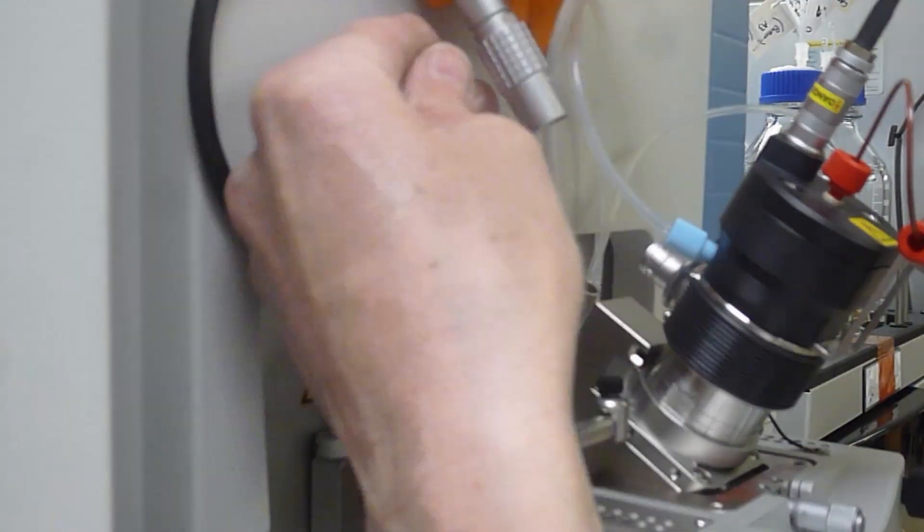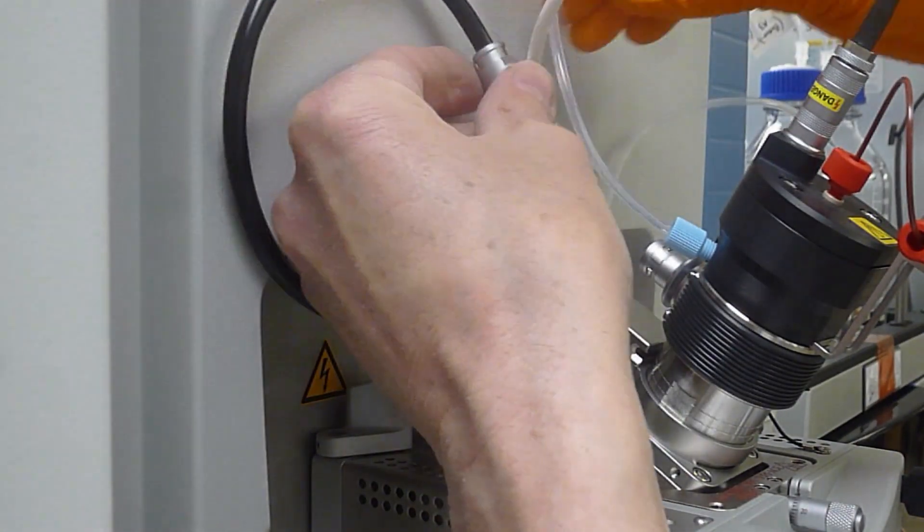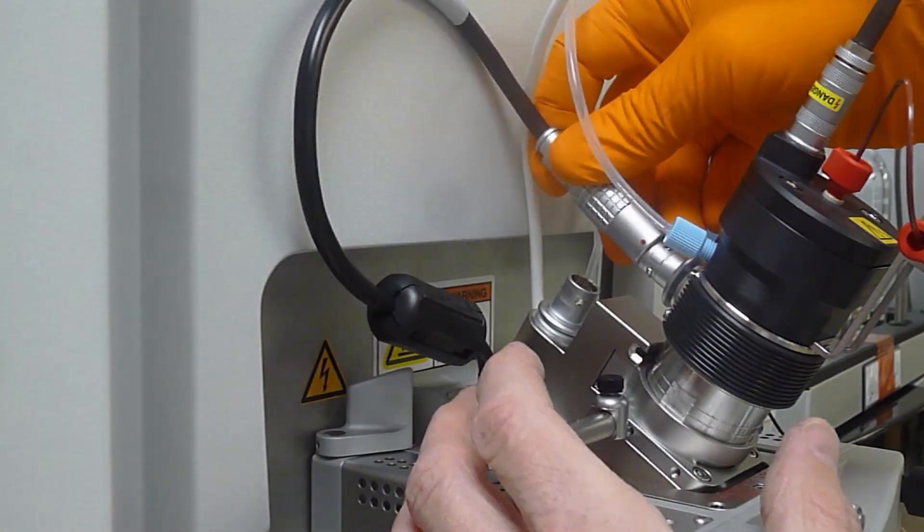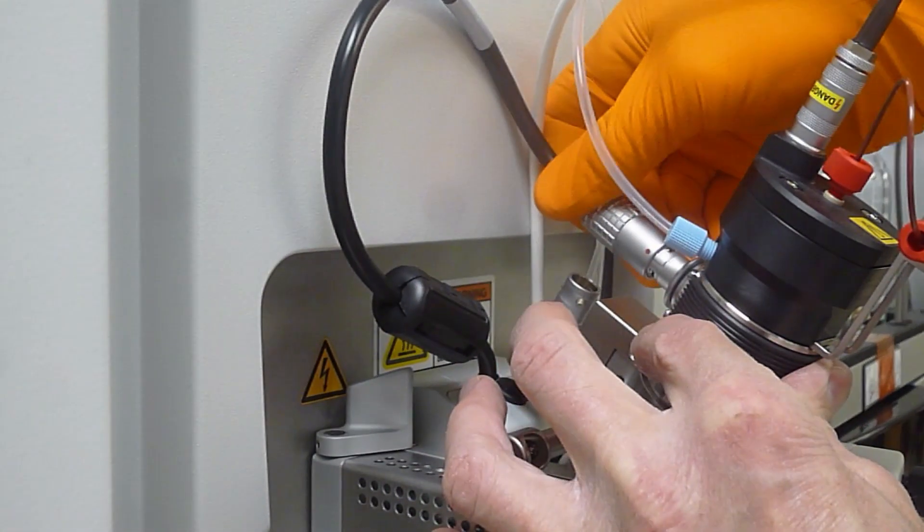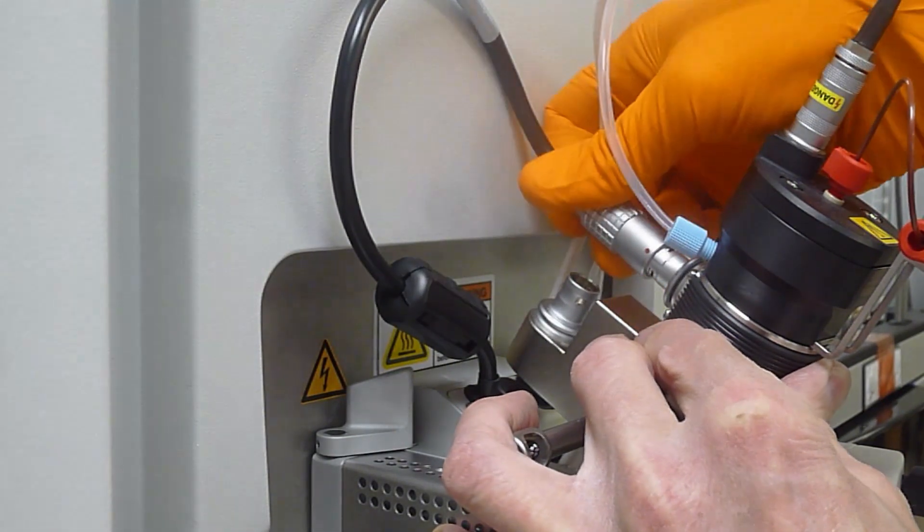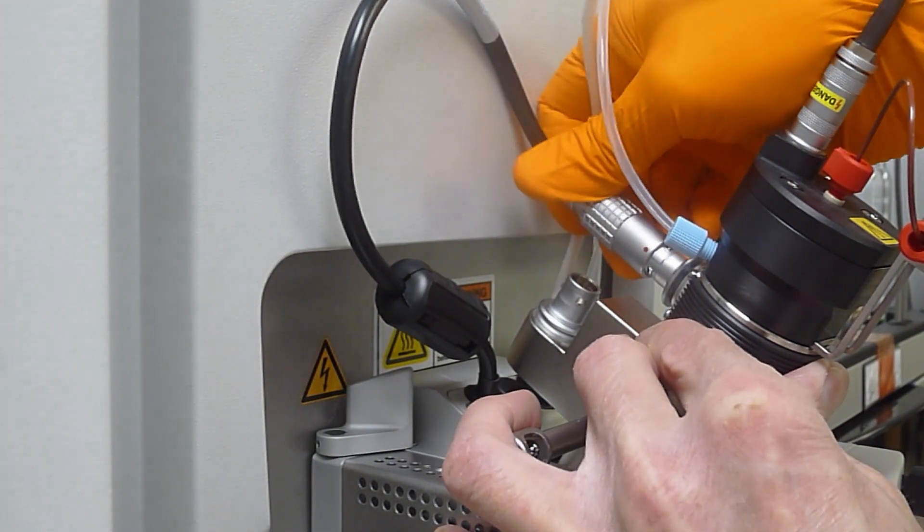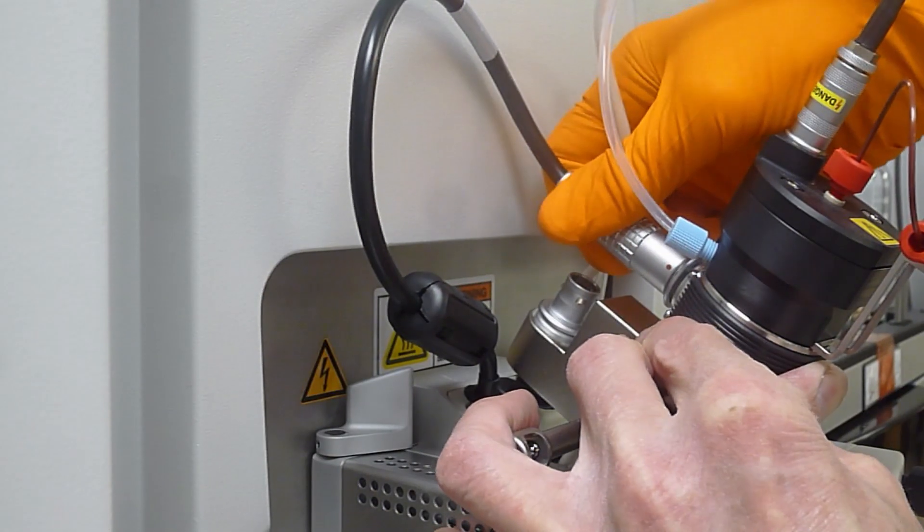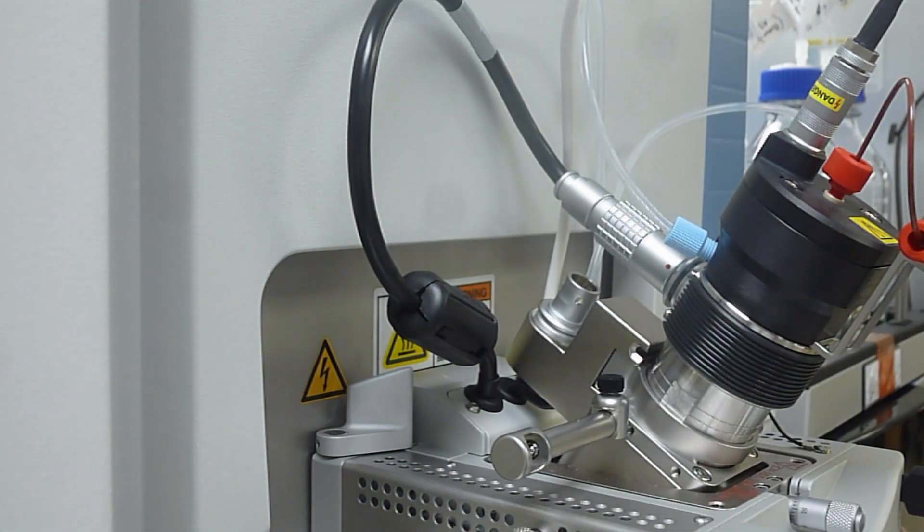Finally, fit the heater cable, making sure that you align the little red dot on the outside of the plug with the dot on the collar. This can also be a bit of a fiddle. The ESI spray chamber is now successfully installed.